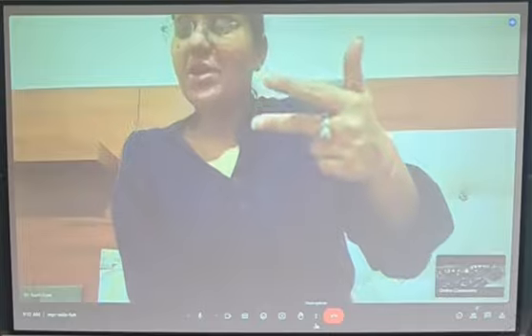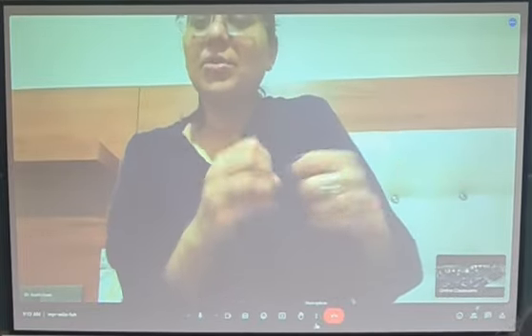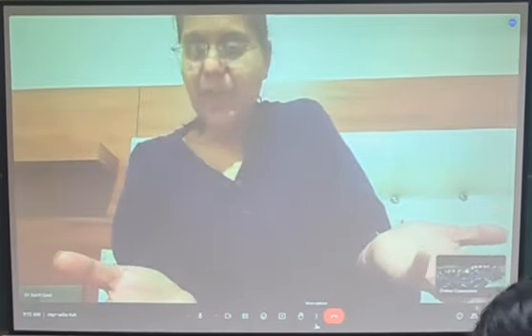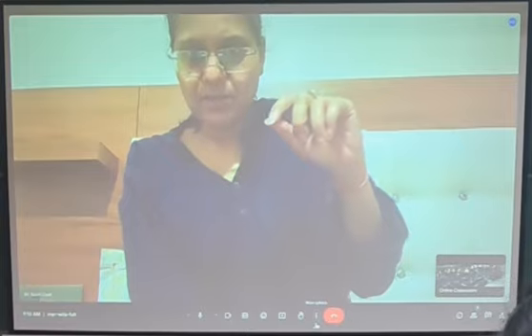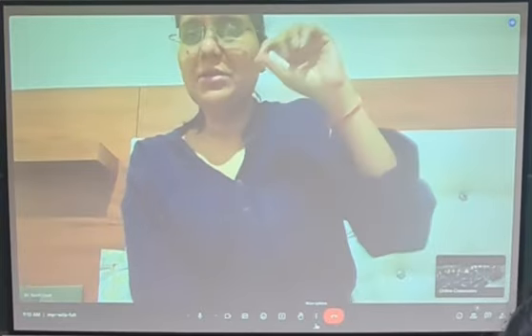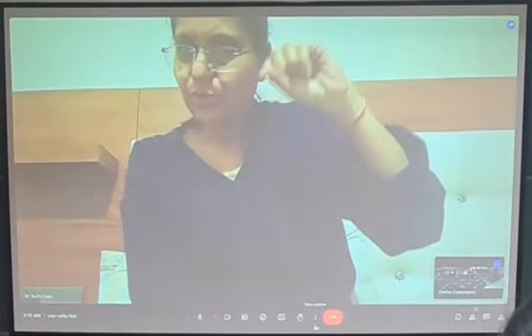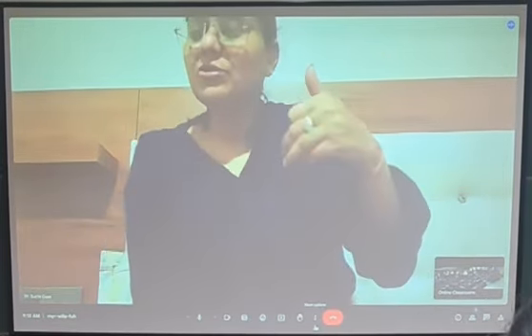Another point is it doesn't matter for you whether the bacteria are live or dead, because you are going to lyse the bacteria, isn't it? You put a lysing solution there. If you remember, you put a solution with SDS. So you still lyse the bacteria. Even if it is dead bacteria, your plasmid will still be there, so you can still use it.